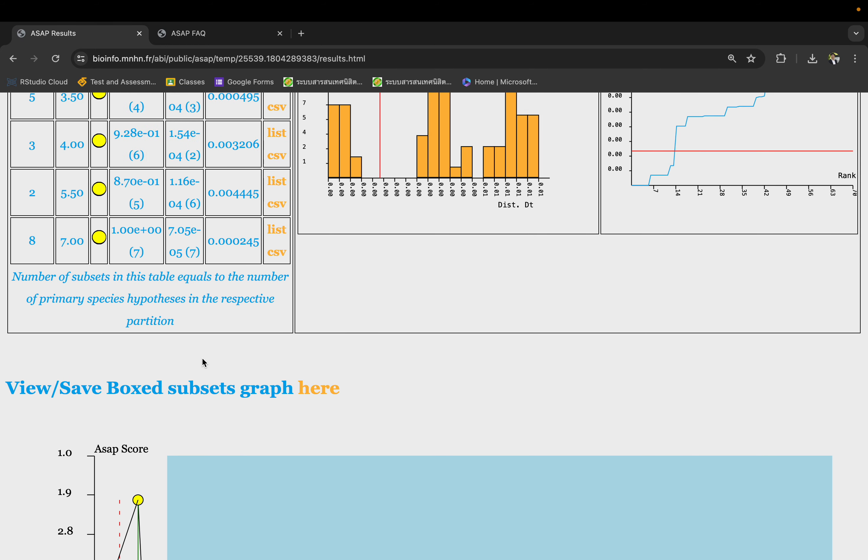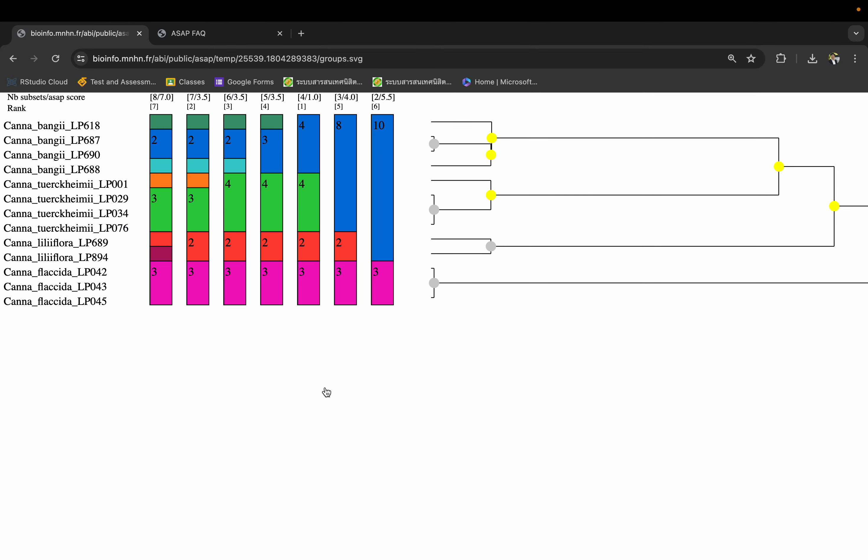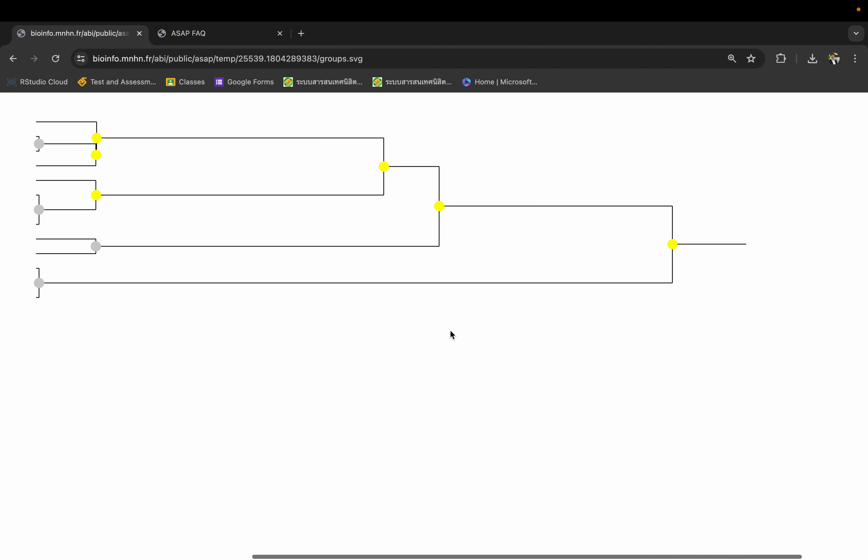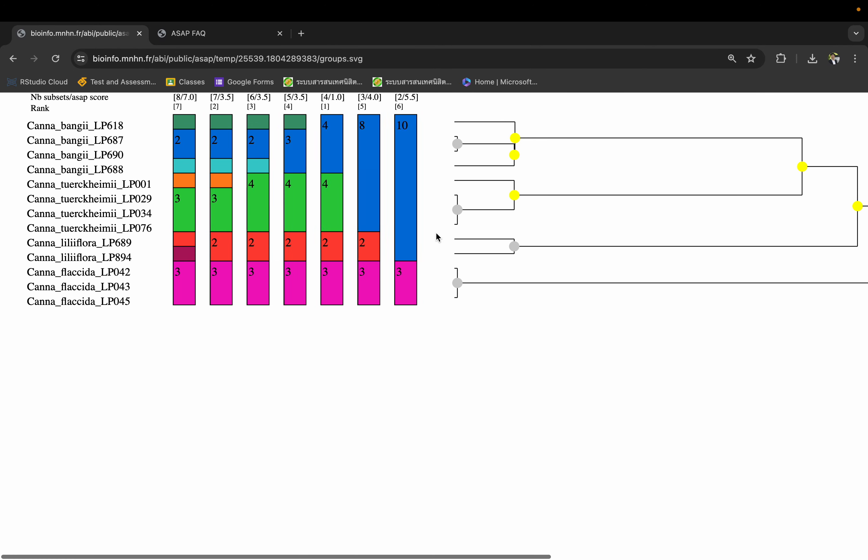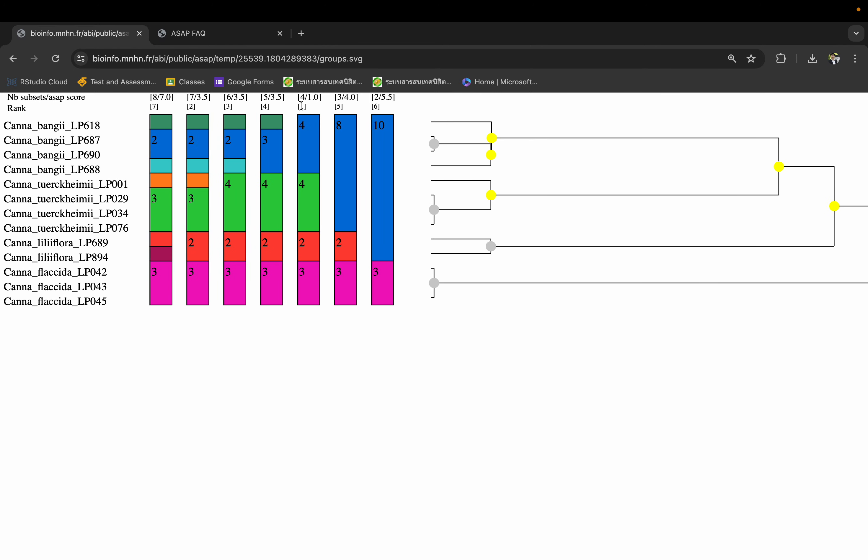A slightly easier way is to come here to view the subset graph. This shows a more summarized version of the result. This is a tree based on the sequence, and the rank is the best subset. So rank 1 is right here - this is the best result that separates them into four subsets with ASAP score equals 1. Subset number 1, 2, 3, and 4. This one has 3 sequences, 2 sequences, 4 sequences, and 4 sequences here. This is the best partition. The others are possible but not highly ranked. The second one is here, but it's not as good as this one. So we will take this one as the best result.